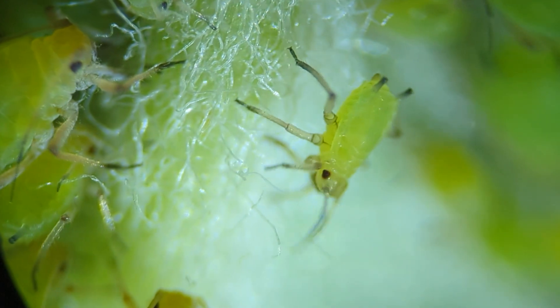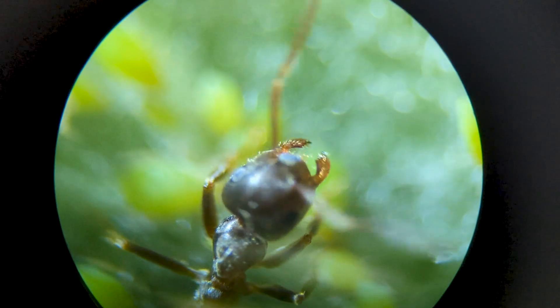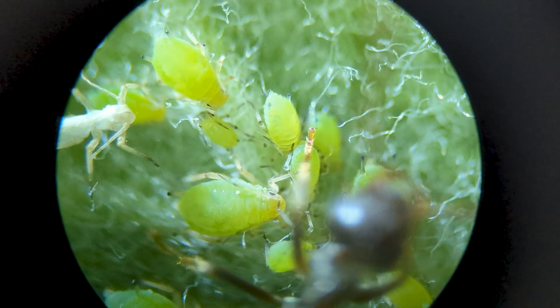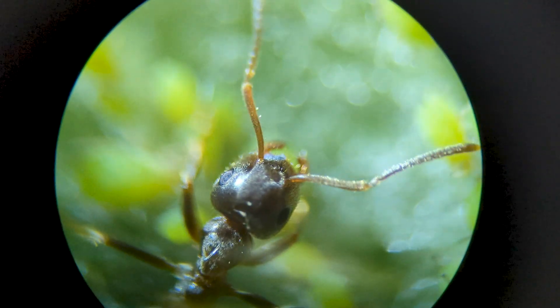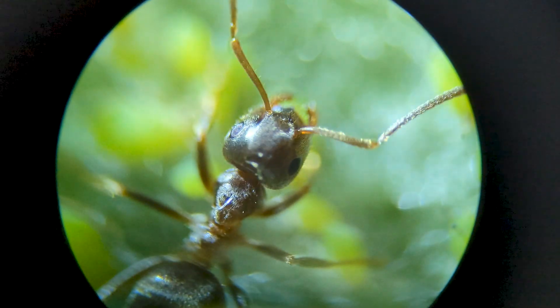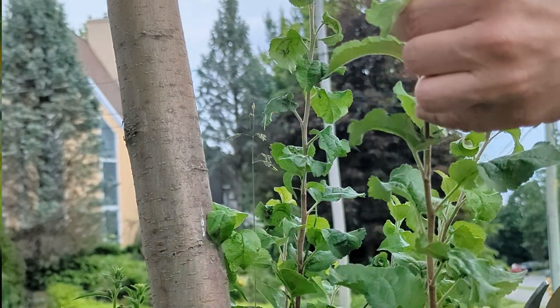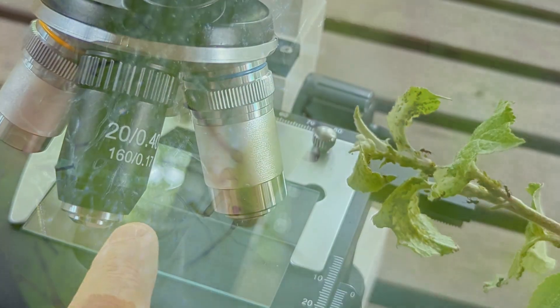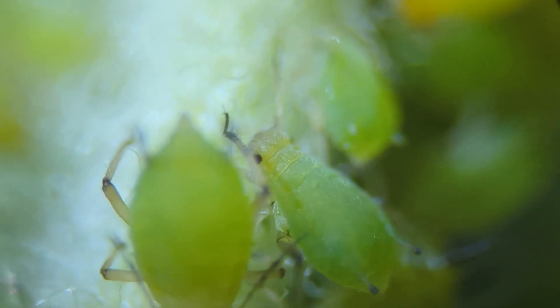You just use the lowest possible magnification, and you don't use a cover slip, obviously, and you just zoom in and out. It has a really tight focal point, which is a little bit annoying, but it kind of looks cool, I think. So what happened here is I had a tree in my yard and it was infested with aphids, and I just clipped off some little pieces and threw them under the microscope. Look at these cool little aphids — they're a lot cuter than I thought they'd be.